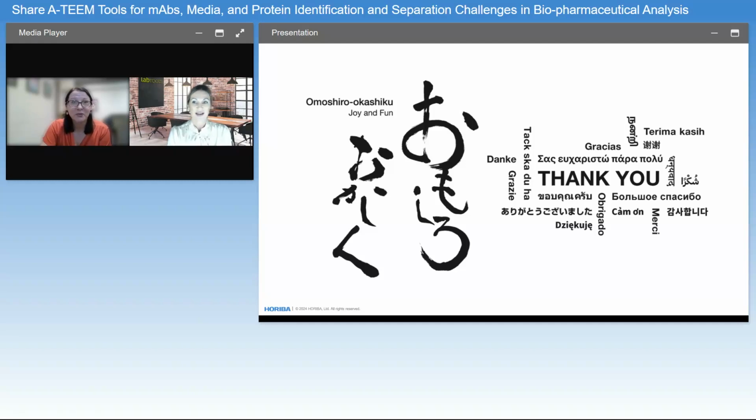Thank you. Next question. If I need an Aqualog that accomplishes CFR 21, do I need the A-TEEM Director? Is that mandatory?